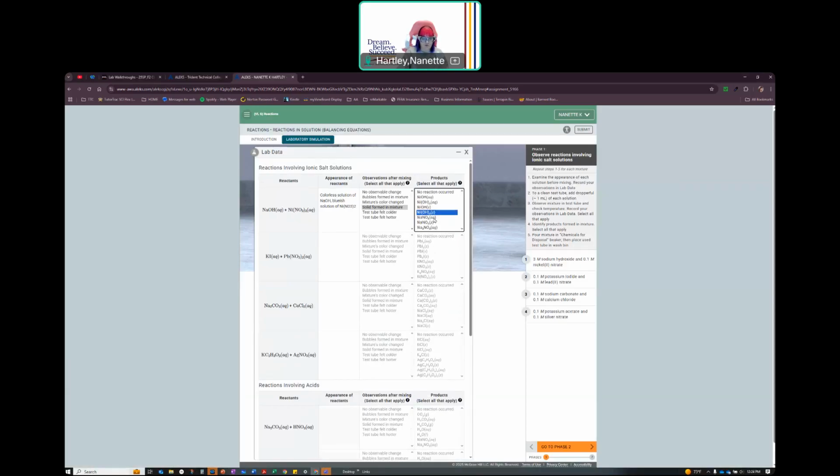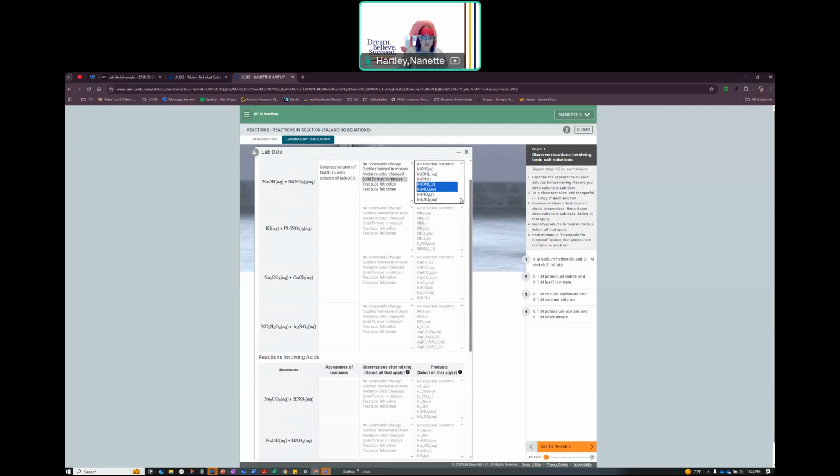And there's one of an Na and an NO3. That's aqueous. Those are two products that I have out of this reaction. So that's what I have for that. Okay, so those are the products that I made. That's the solid that I formed, the Ni(OH)2. And those are the observations. Cool with that. So those are my observations.